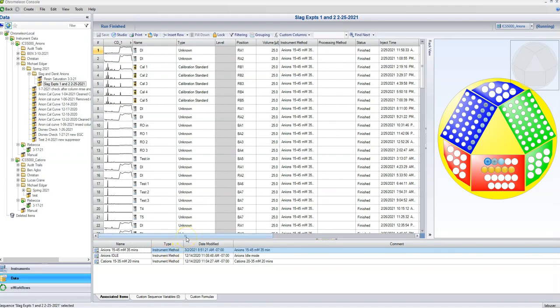All right, so congratulations on making it this far. Now let's get our data off of the IC, the moment we have all finally been waiting for. Obviously we're going to start by going into our file and finding our finished run. I'm going to use this one as an example because we have all of the data and there is no processing method for it.